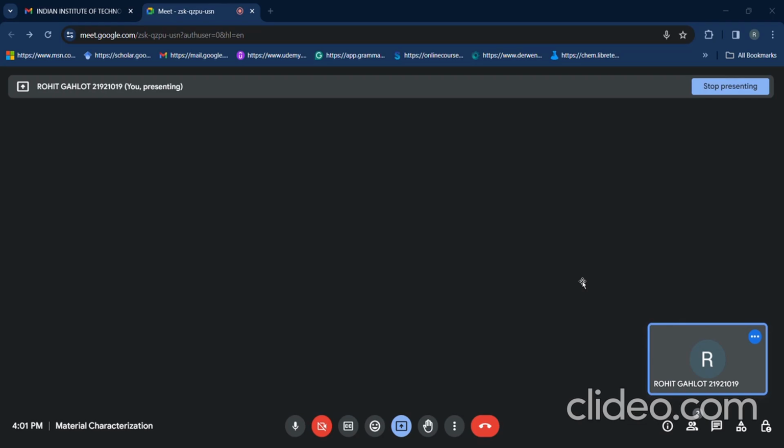Therefore, in this experiment, it is assumed that the equipment is in ideal condition, and we consider the equipment to obtain the best precision in the lattice parameter values. So please keep in mind that accuracy is very critical. If you want to know the lattice parameter to within 1 times 10 to the minus 5 nanometer, you must know the peak position to within 0.02 degree at a 2 theta value of 160 degree. So lattice parameter measurement is a very indirect process.